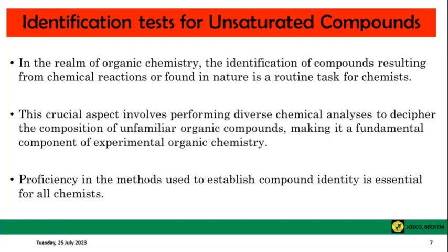Identification test for unsaturated compounds. As you are aware, to identify organic compounds is more like a routine task for anybody who wants to do chemistry.